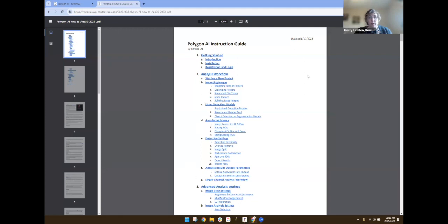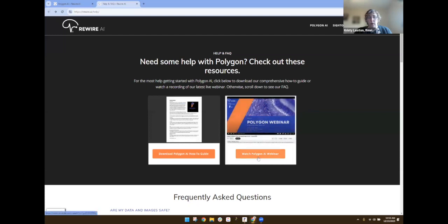So I highly recommend you download this and reference it. You can also go watch an older webinar, but this will also take you to our YouTube channel where we have several small snippet videos that show you how to do certain types of analysis.